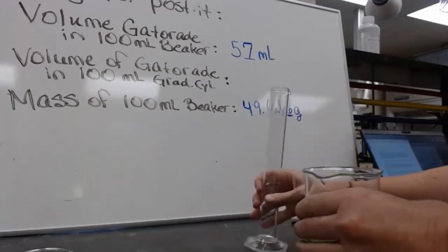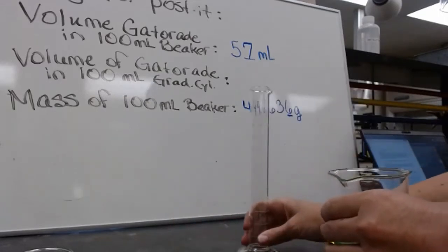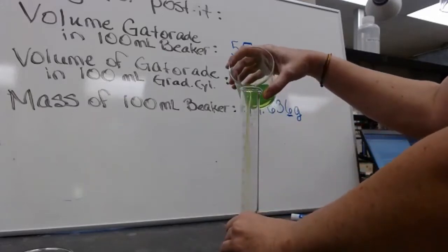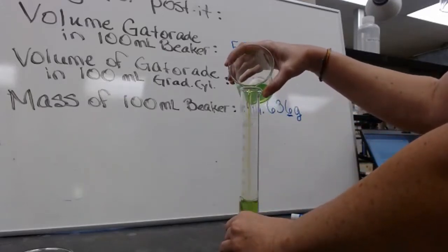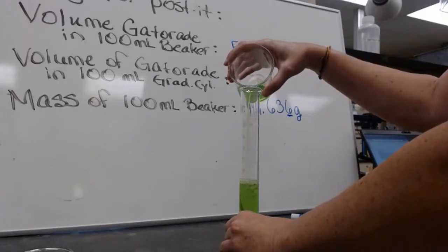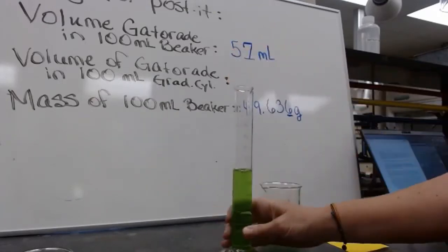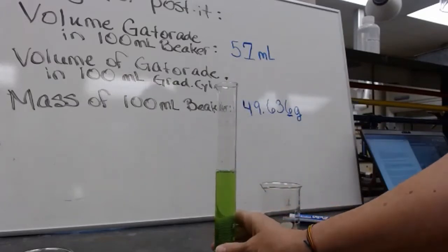If I take some of this Gatorade and I pour it into the 100 milliliter graduated cylinder, the process is the same.